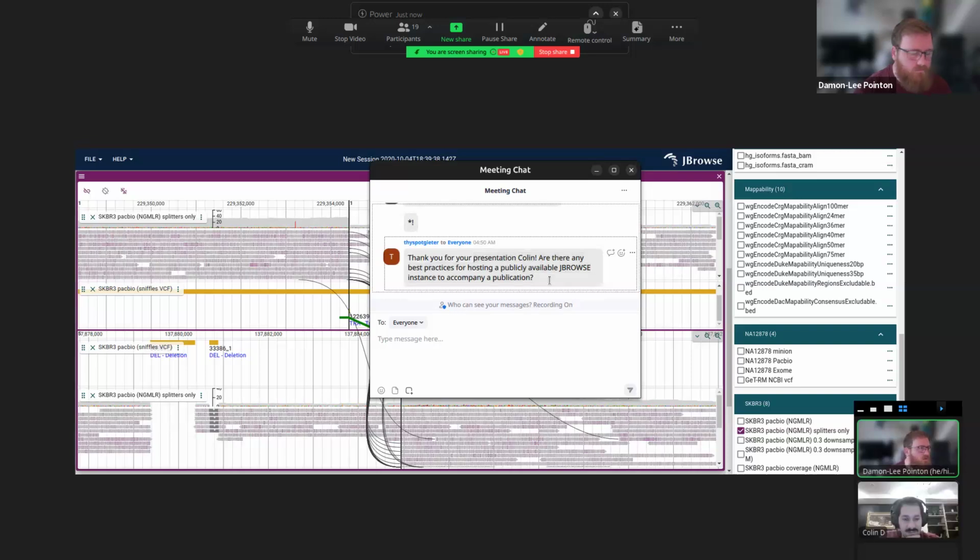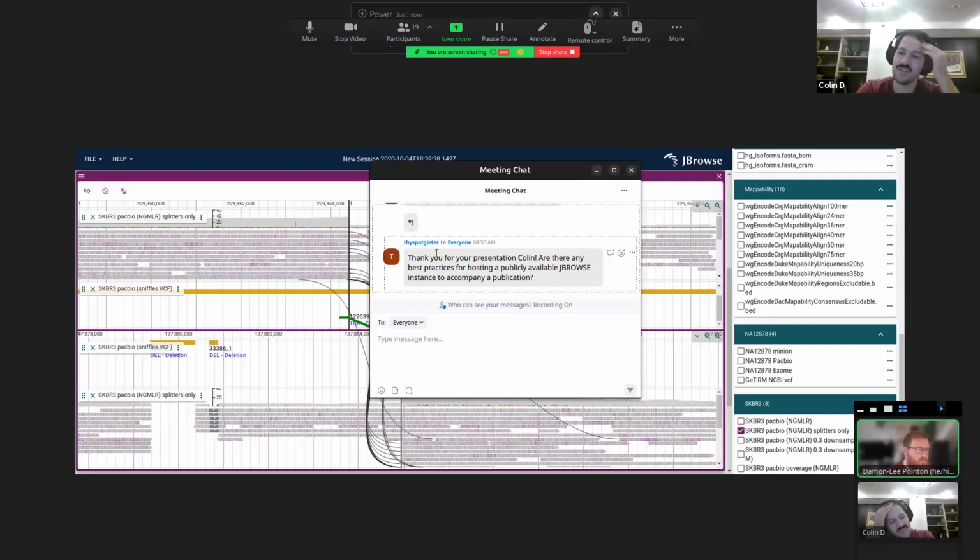I've lost the YouTube stream, so I'm just trying to find that and see if anyone has asked anything. I saw one from Tias. He said, are there any best practices for hosting a publicly available JBrowse to accompany a publication? And I would say there's not really too many. If you can put it on a web server, there are such classic ones as Apache and Nginx. Those work fine.